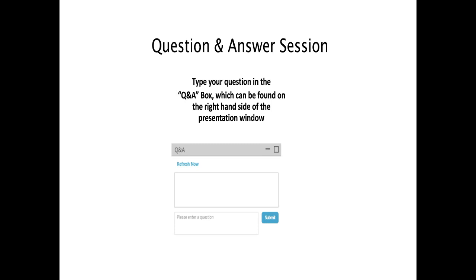We would never advocate storing with additives, certainly not in acidic or basic conditions. So abide by the guidelines of the manufacturer in terms of the storage of the column. As I mentioned before, for our columns we found IPA is the most suitable storage solvent. I hope that addresses that question.